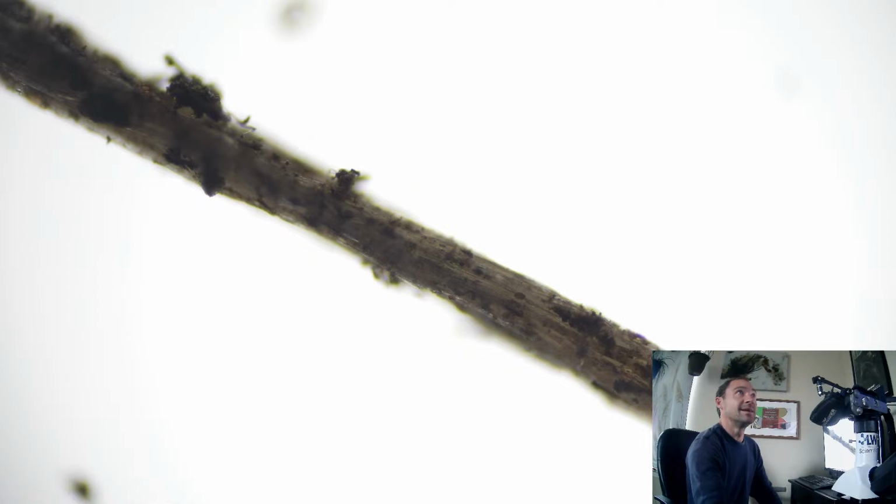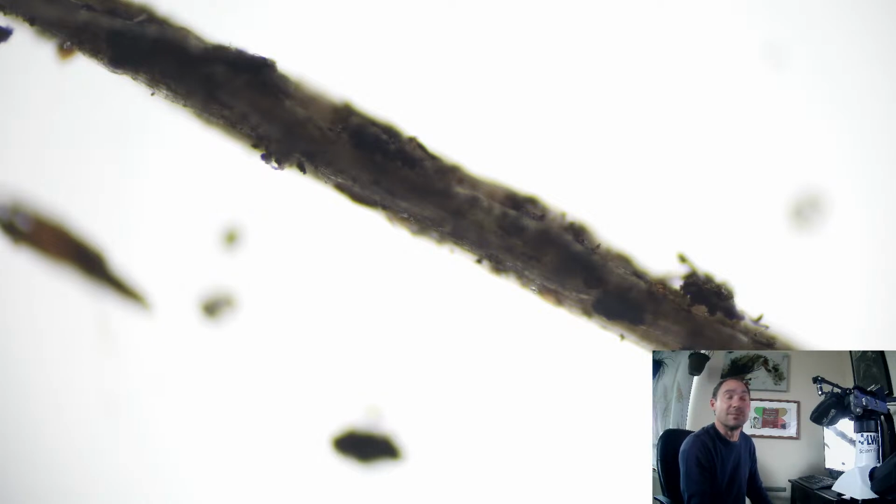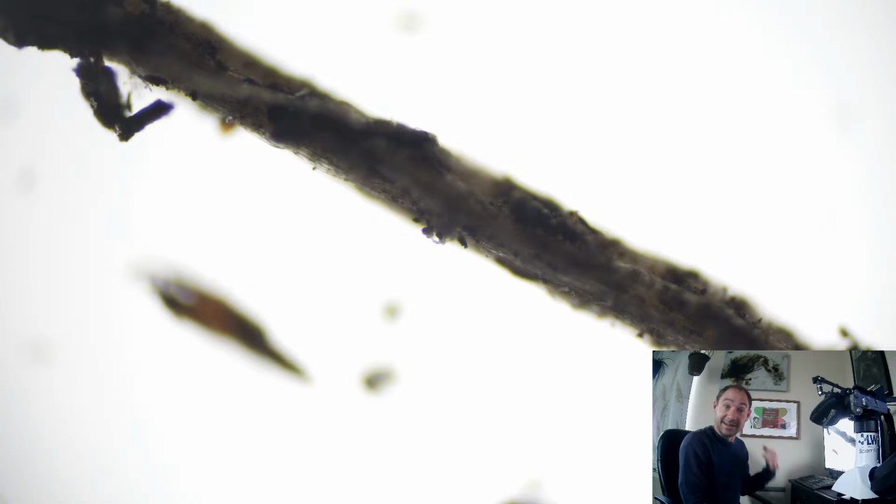I feel like it's important to share this, because it's all just another way of seeing things. Just like we go out and look in our garden, observe our plants and how they're doing, we can also put a sample under the microscope and observe how our soil health is doing. And now, like in this video, we're looking at the roots, looking for differences, seeing if it's healthy, and what signs we can see to correlate to what we see outside in the garden. So we're going to find out a lot of cool stuff.